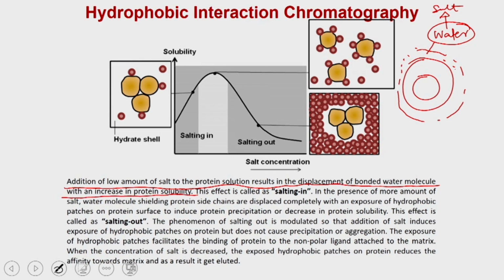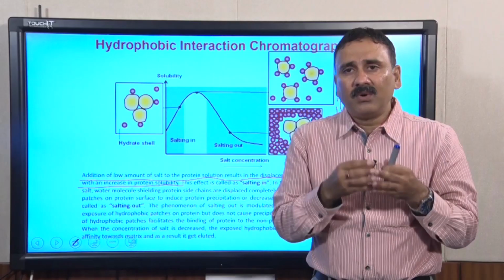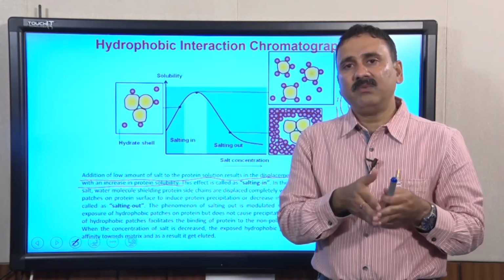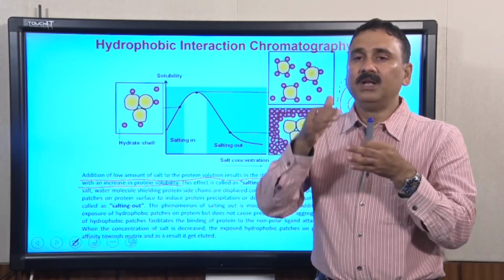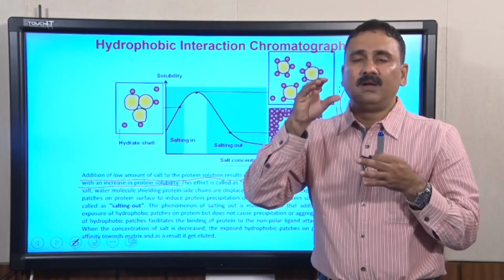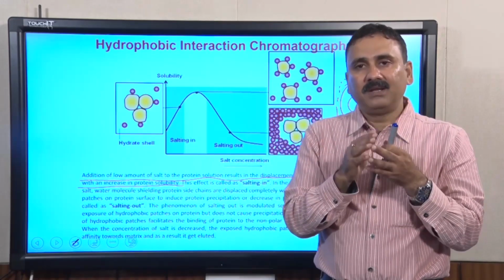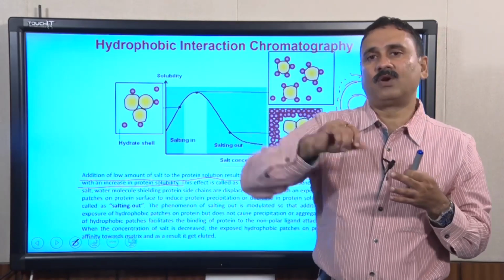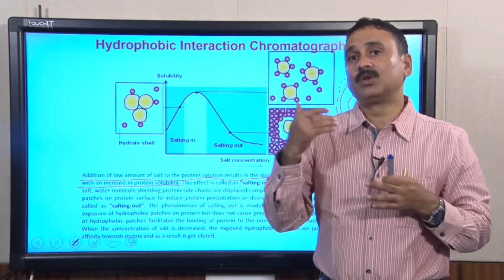Because you are removing the water, which makes more space available for more protein molecules to be solubilized.